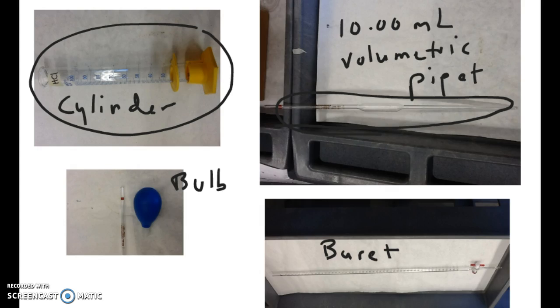So here I just want to show you the different glassware that you use for part A. As I said earlier, the first one is going to be a 100 milliliter graduated cylinder, which you would already have in your locker. You're also going to use a 10 milliliter volumetric pipette, and that one is something you have to check out from the stockroom. You also have to check out the pipette bulb that comes with that pipette in order to be able to use it. You might check out this bulb, or there are other bulbs that the stockroom might give you. And the last item that you're going to use to measure the volume is the 50 milliliter burette, and that's another item that you have to check out from the stockroom.